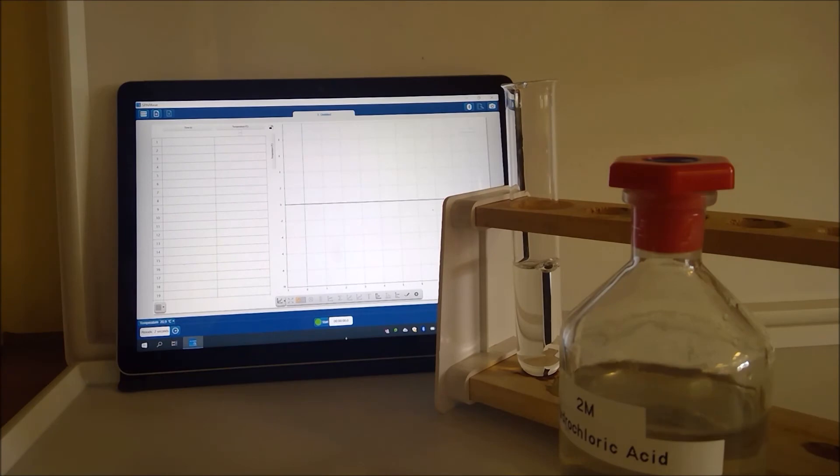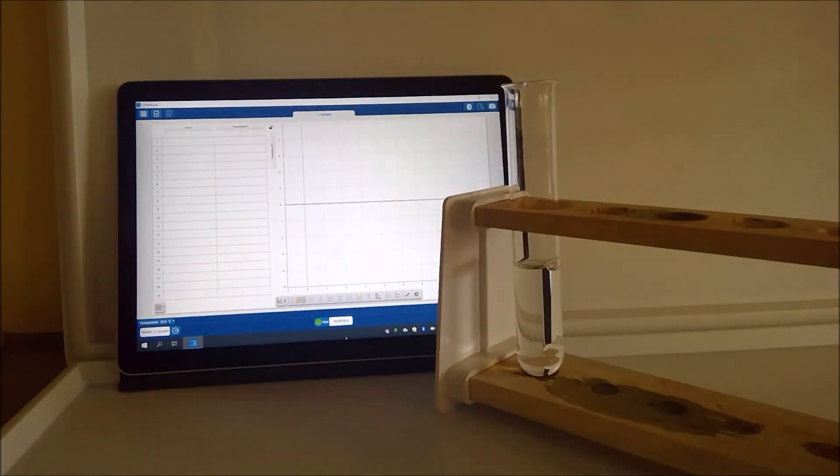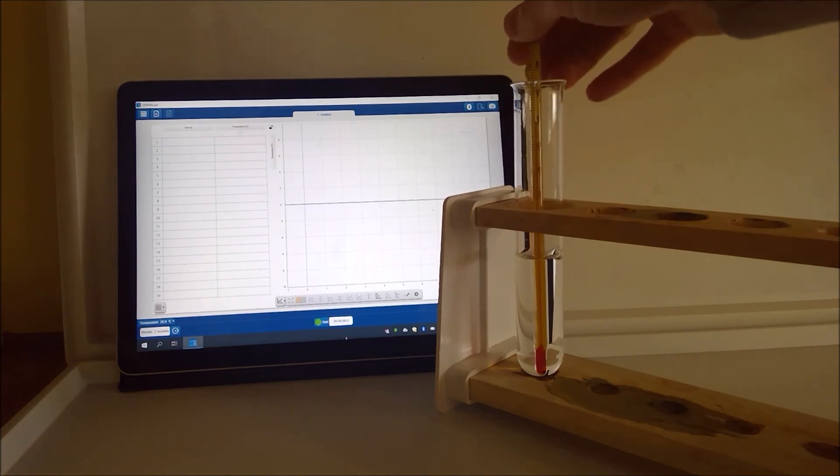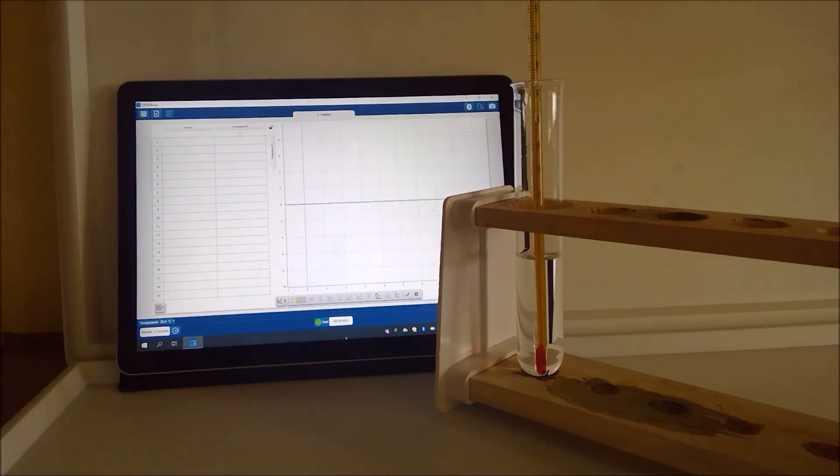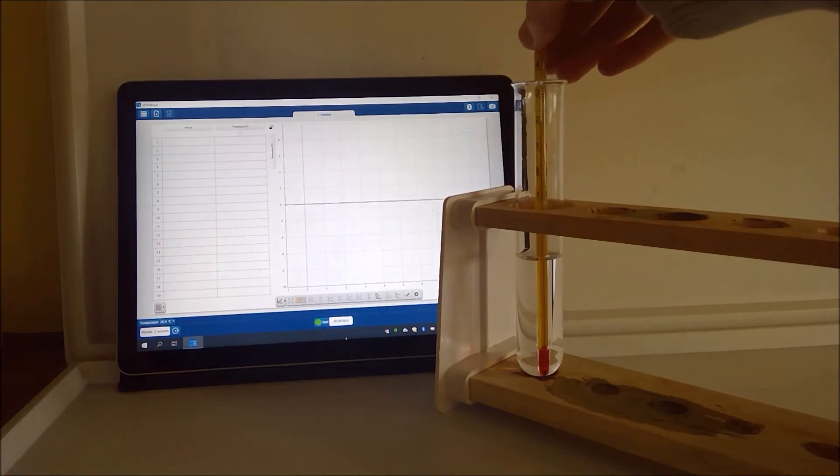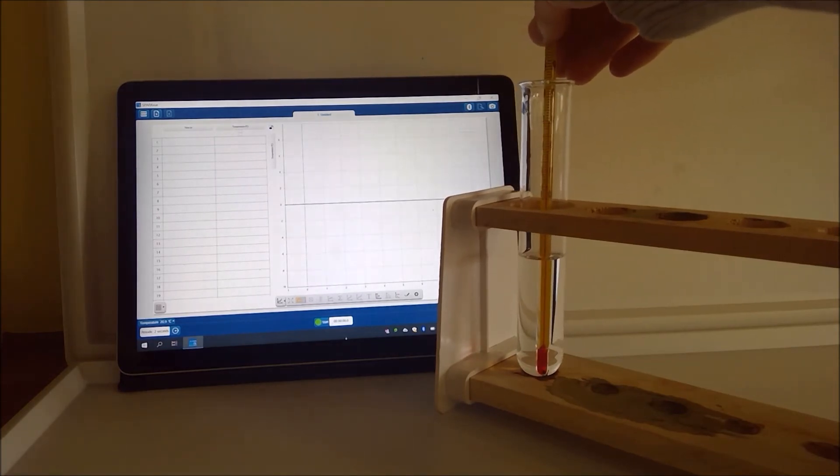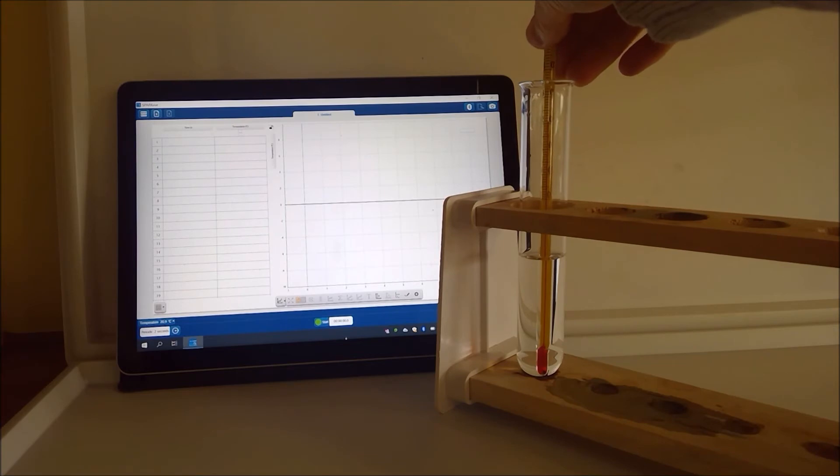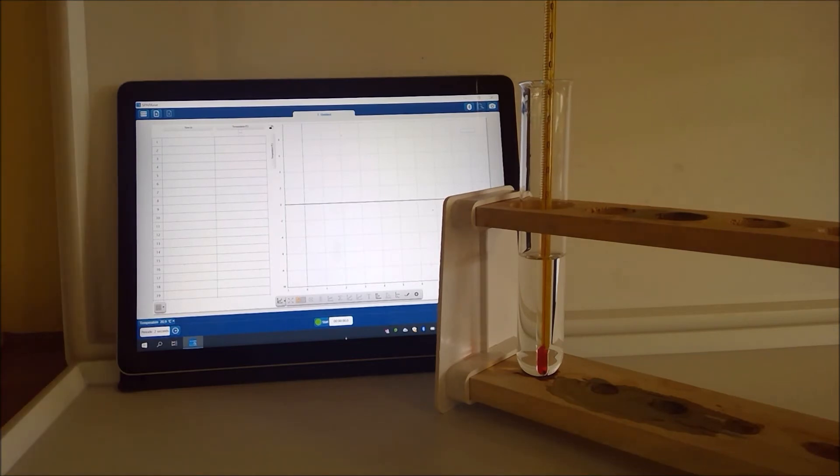Now this time we're just reacting with a solid with a piece of magnesium. Okay so like before we're going to record our starting temperature.